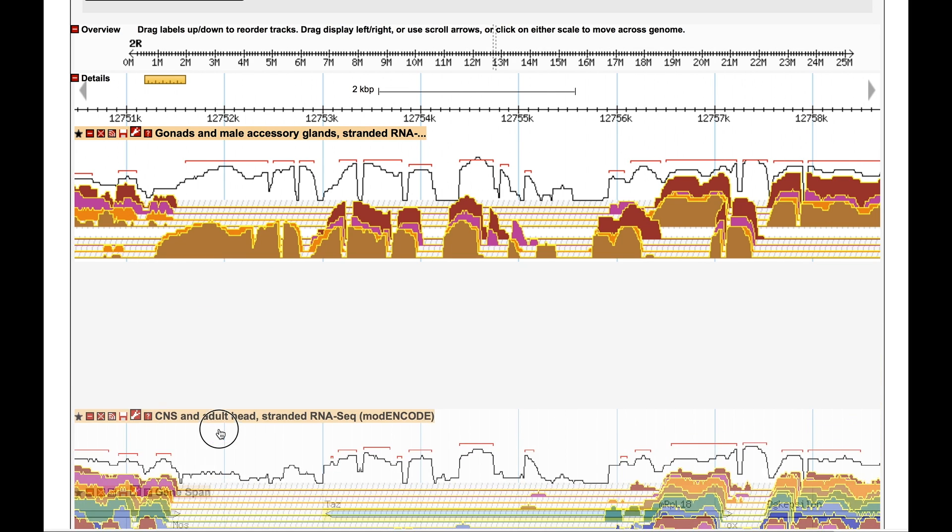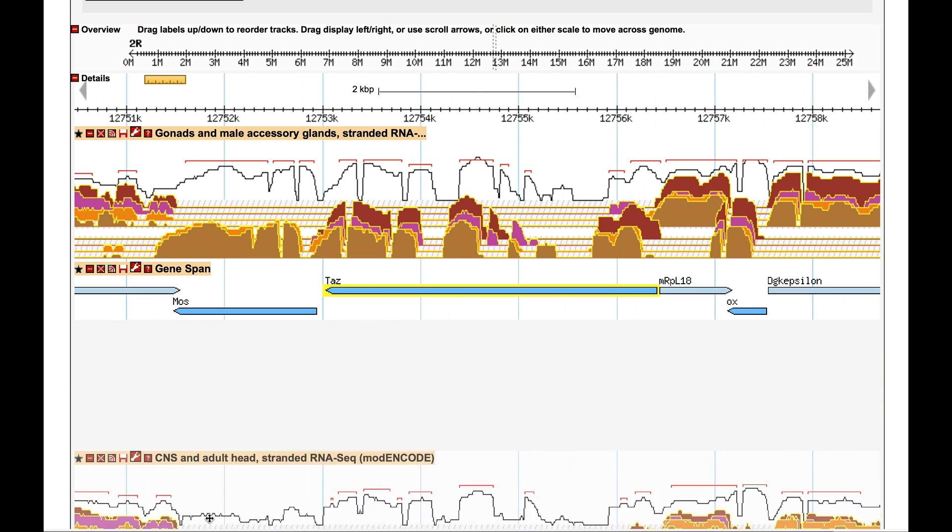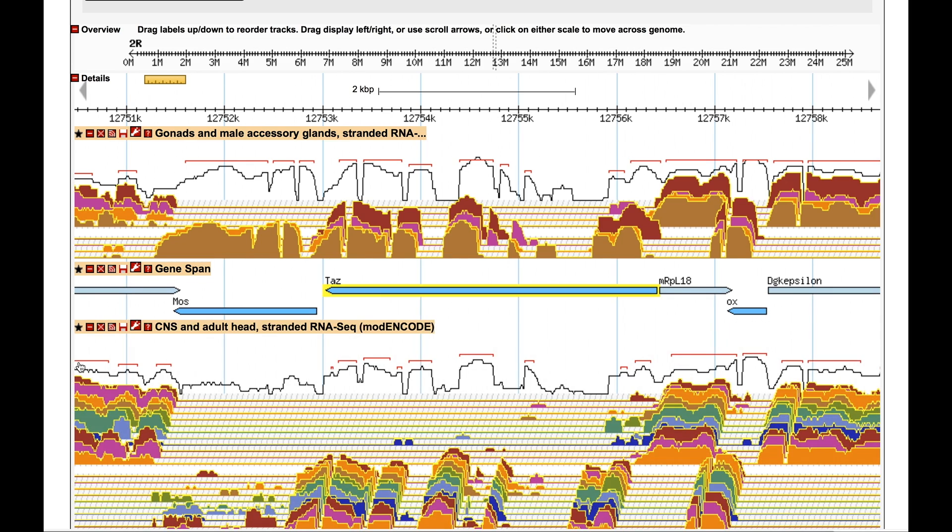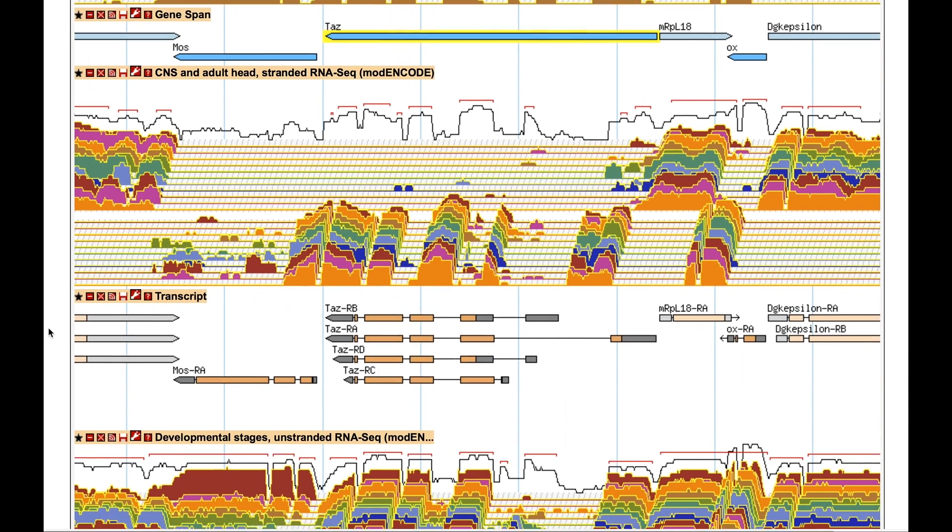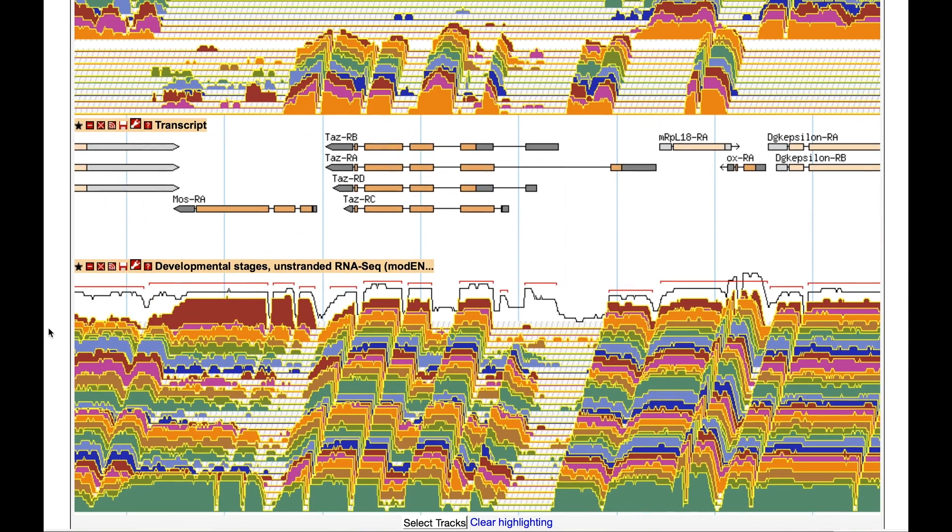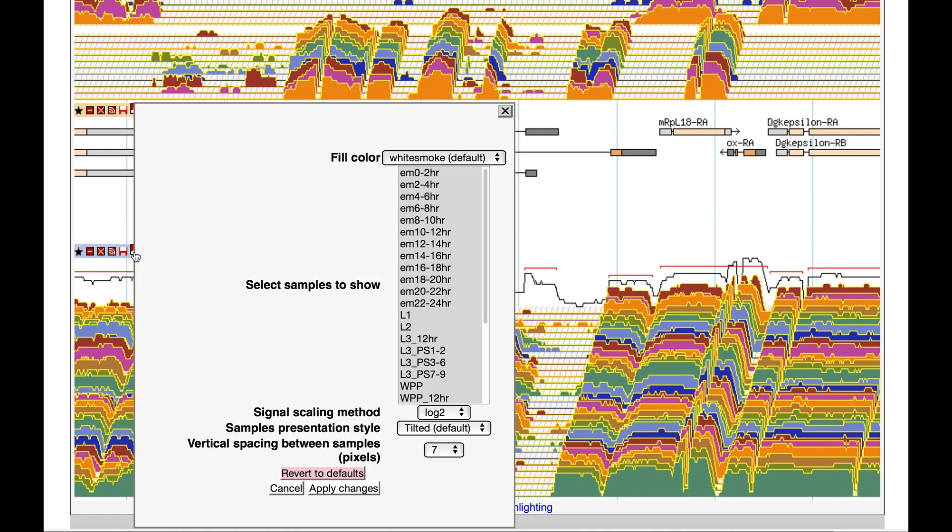You can reposition the tier by grabbing the label and dragging up or down. Another useful feature is formatting options for the ARNESIC tiers. Clicking on the icon Configure this track brings up a box with several options.